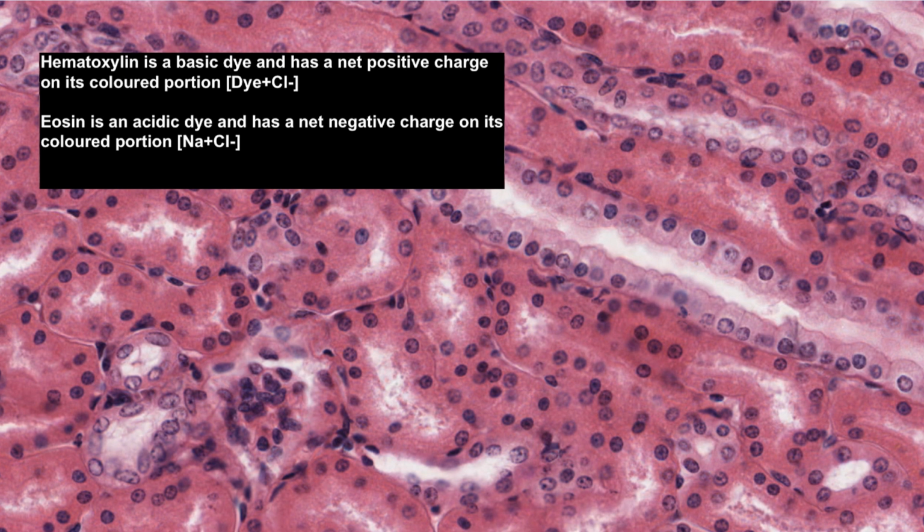First, just an important request please. Do not worry about being able to identify all the tissue components I will show you in the images that follow, even though I will probably mention what they are. I am using them only to illustrate different histological stains and what specific components in the tissues they stain. You'll have plenty of opportunity to study these structures where appropriate in this histology course syllabus.